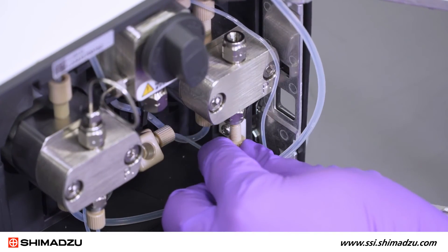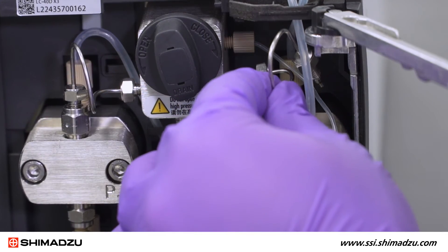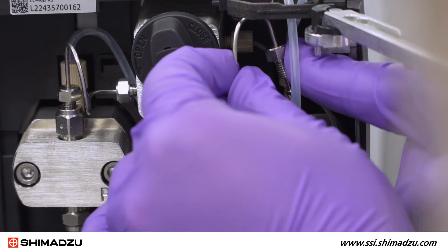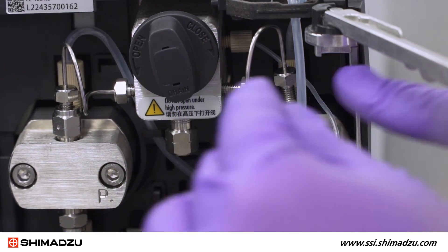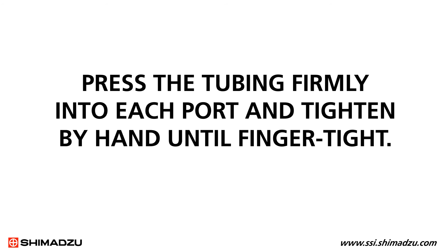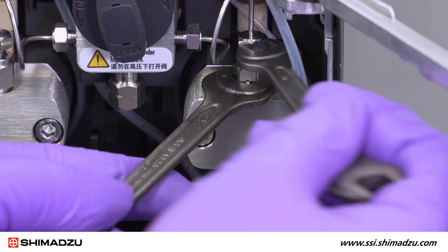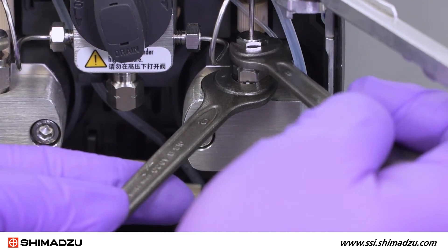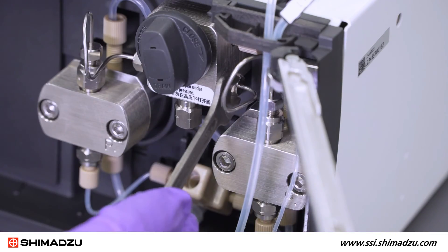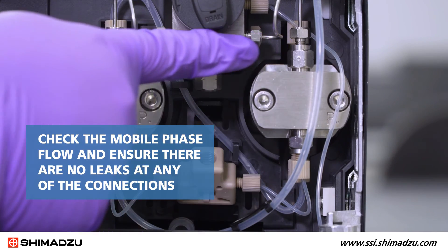Hand tighten the peak fitting of the inlet tube to the inlet check valve. Then connect the stainless steel tubing by inserting one end of the pipe into the hole of the pressure sensor and the other end into the outlet check valve. Press the tubing firmly into each port and tighten by hand until finger tight. Hold the check valve with the 10mm wrench and tighten the nut of the tubing with the 8mm wrench, then tighten the nut at the pressure sensor side. Check the mobile phase flow and ensure there are no leaks at any of the connections.